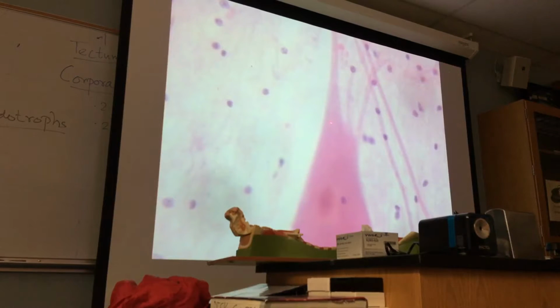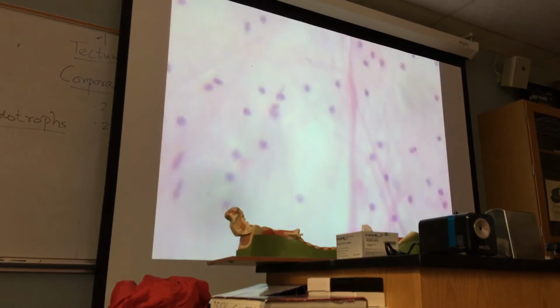This part is called the axon hillock. Axon hillock and the initial segment of the axon form the trigger zone. So there, all the impulses from the different sources accumulate, and if that reaches threshold, then an action potential is generated. So let us follow this axon.